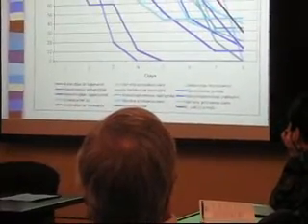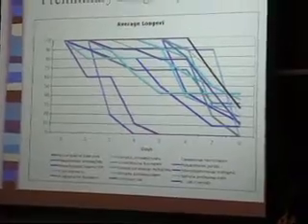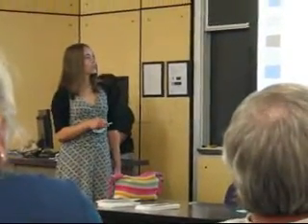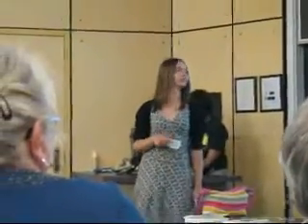These are our preliminary longevity results, and as you can see here, these are the 2 potential pathogenic bacteria, and they did not live for very long at all. In that, you can see the similarities between the number of offspring they reproduced and also how long they lived. It was very much a similar correlation there. And then also these are kind of clumped together. You can see this, they were on the other side before.